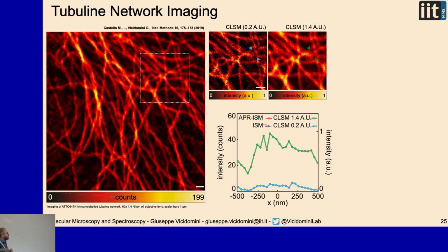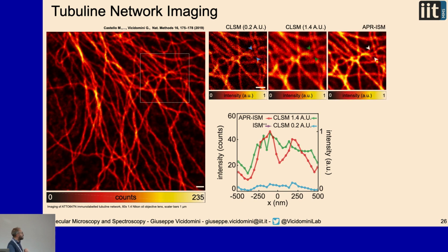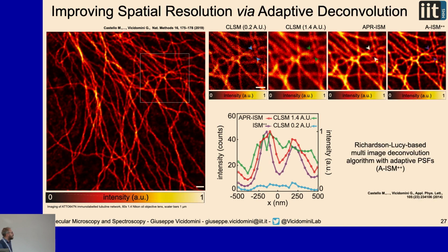That's the intensity profile along this direction, but the resolution degrades because I'm losing some spatial information. If I apply pixel assignment, the approach that I told you before, here you can see a nice improvement in resolution. You can better see here that you clearly see these two peaks. That means that the resolution improved because now I can distinguish two features in my sample.